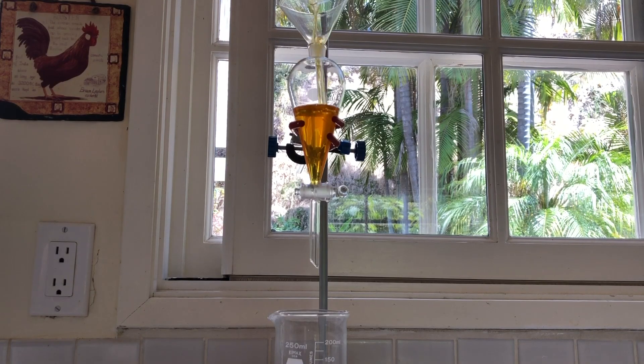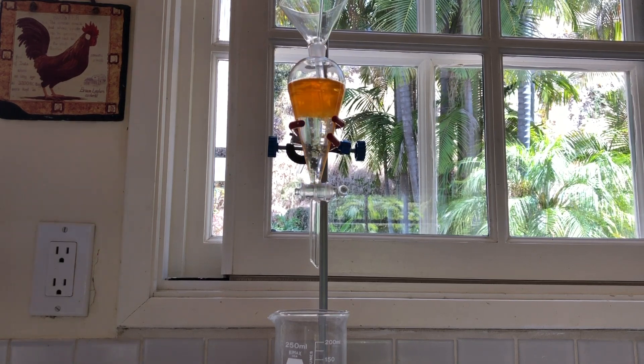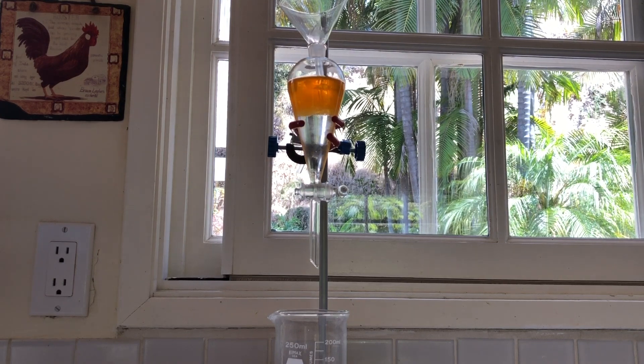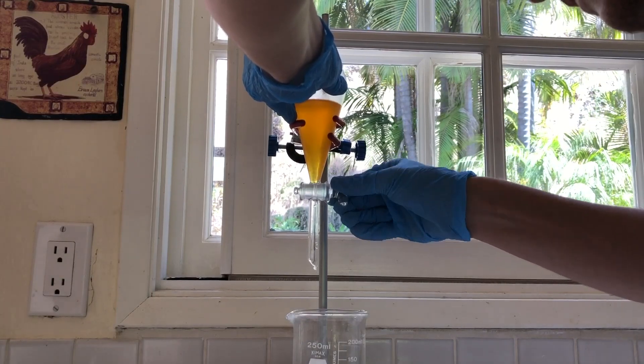The orange liquid was washed with 2 aliquots of 50 ml of water, though I should have used less since benzene is soluble in water. With 100 ml of water, I expected to lose about 0.2 ml of benzene. The mixture was capped, shaken, and vented, and the lower water layer was drained and stored to be properly discarded.